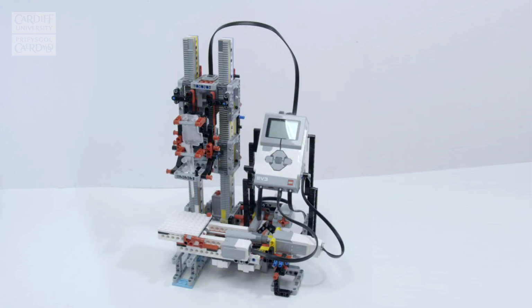It's also a material that, because it's readily and widely available, the parts are all standardised, so we could share a parts list so that other laboratories across the world could build an equivalent printer to the one we have developed. And in fact, we've been doing that internally. We've had new students come in and build a new printer to replicate our existing ones in less than a day, and that gives us multiple printers that we can start further refining, further developing and doing further experimentation with.